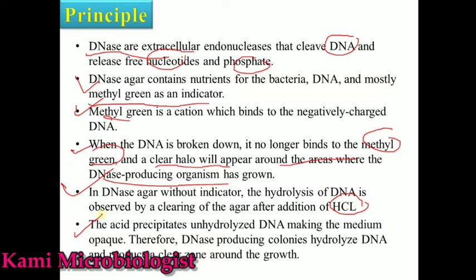One thing more, the presence of deoxyribonucleic acid outside the membrane is specially used to detect the enzyme. Once the enzyme is released, it can easily be identified on the media. Okay, so that's a little bit about the principle.